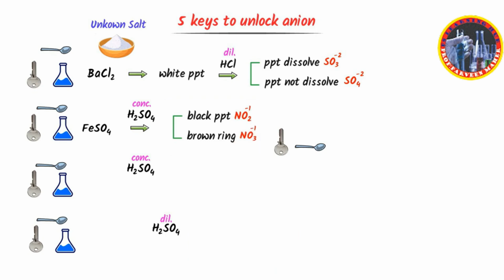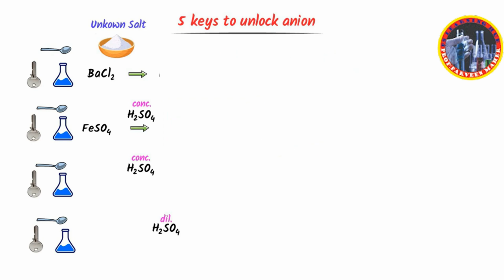But wait a minute. What if we do not get black precipitate or brown ring?